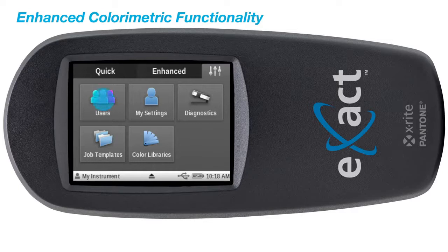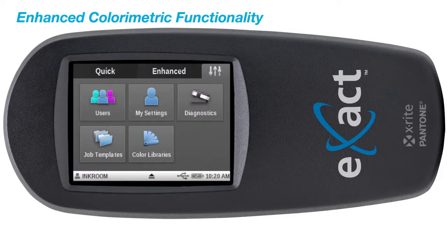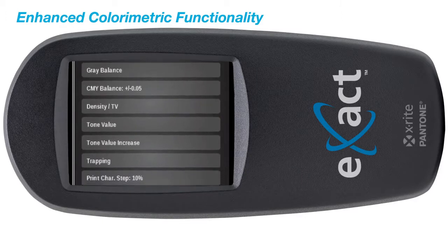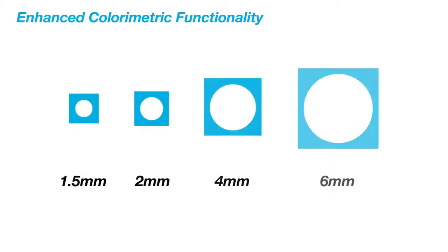The Exact Advanced is the most configurable instrument on the market: 1. Offering multiple advanced user profile capabilities, allowing you to configure your device for multiple user profiles and different configurations. 2. Driving workflow confidence for each job as tools can be locked and customized. 3. Providing a full range of aperture sizes to provide job flexibility as your business needs change. And finally, providing substrate analysis capabilities with the brightener index function.